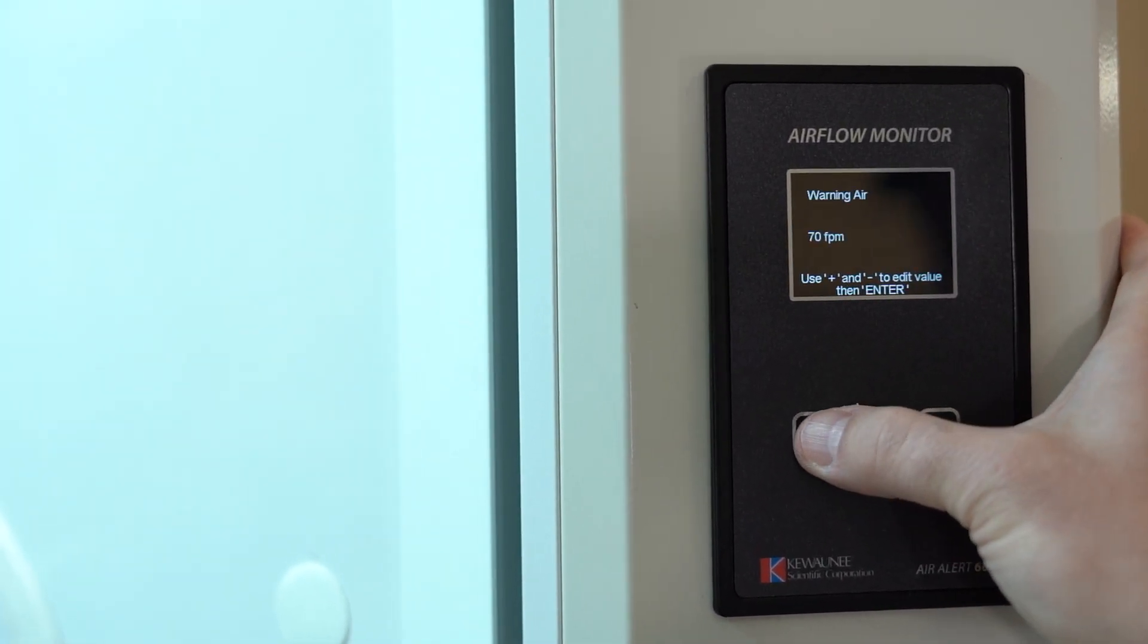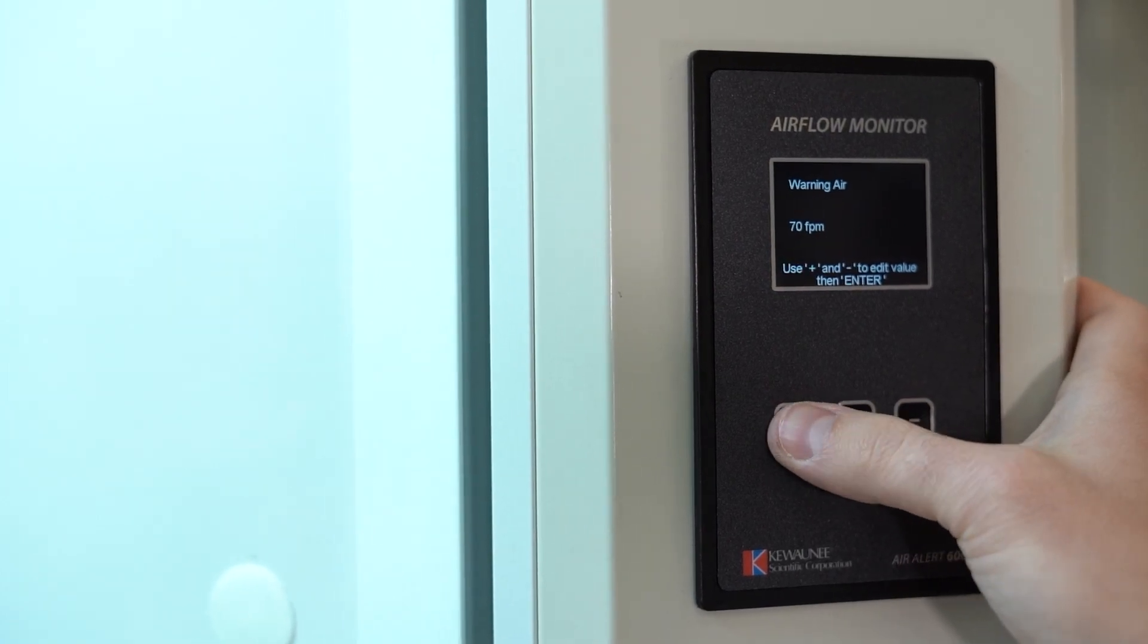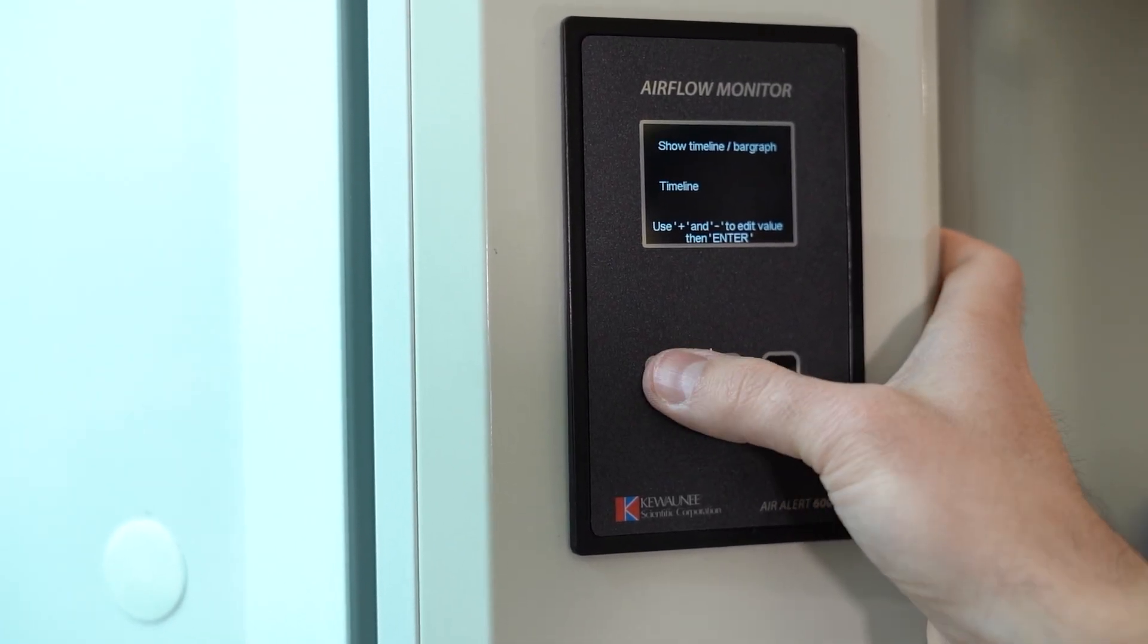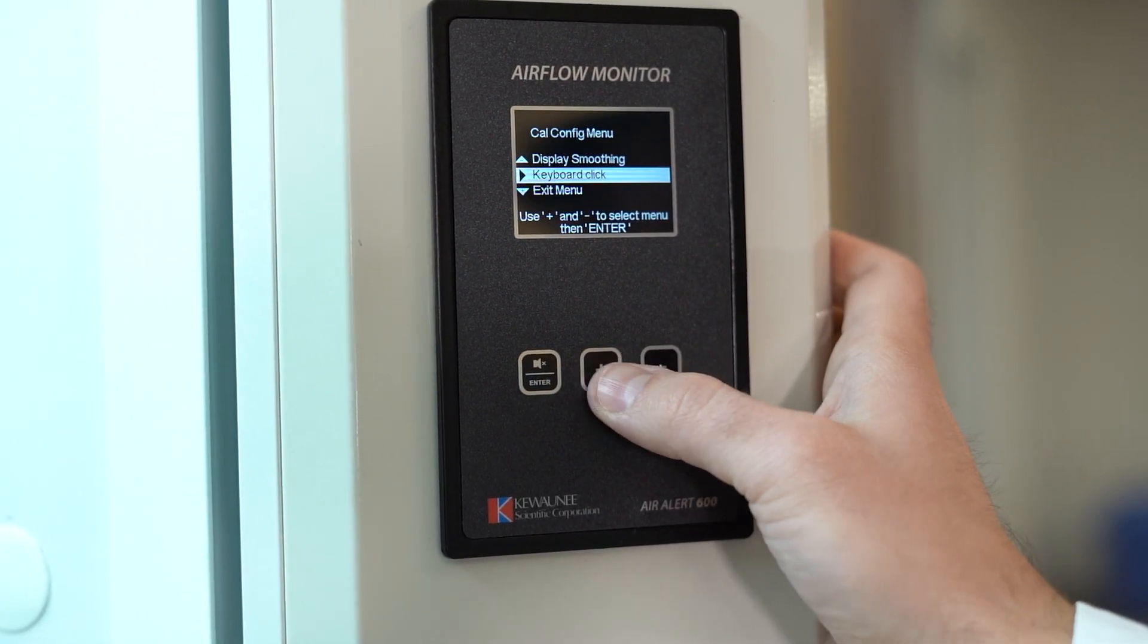Many users find it useful to turn on a timeline of airflow history displayed on the monitor. This setting is called show timeline bar graph. This will show you a quick view of the last hour of airflow values.